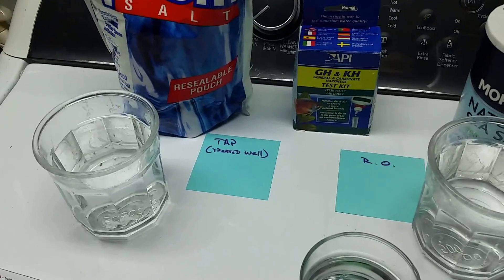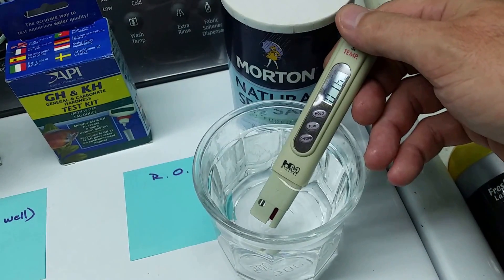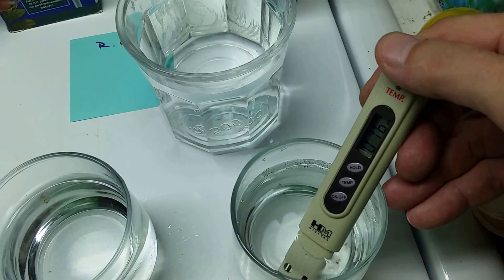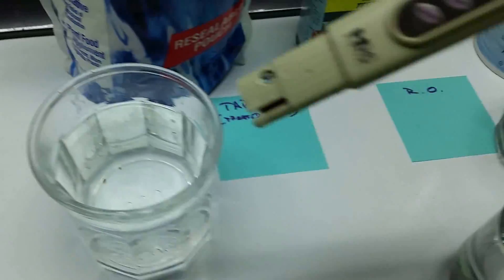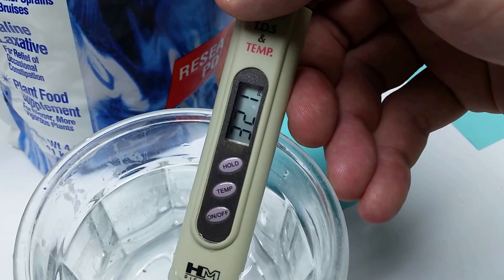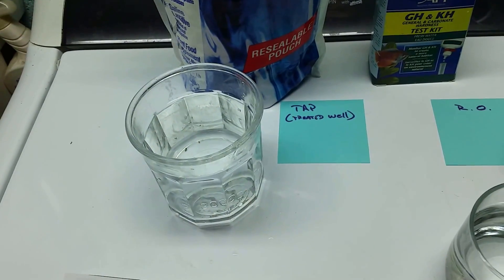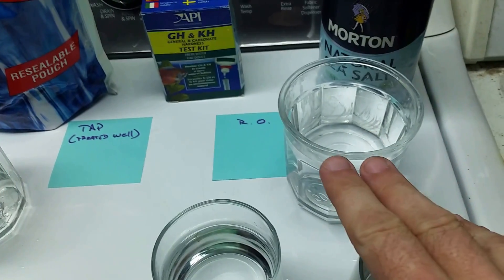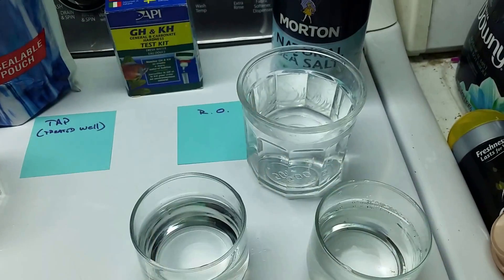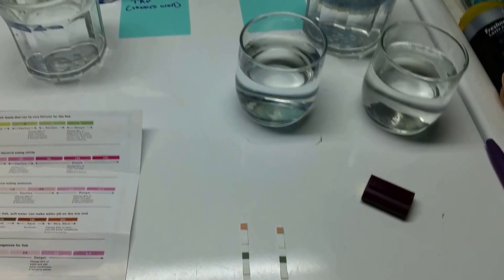Let's have a look at what's going on with the water. My RO water reads about 16 parts per million on the TDS meter, and likewise the second RO sample is also 16 parts per million. My tap water comes in at 320 to 321 parts per million. I'll do a general hardness and carbonate hardness test of my tap water and the RO water, then test our two experimental samples, and see what the dip strips say.